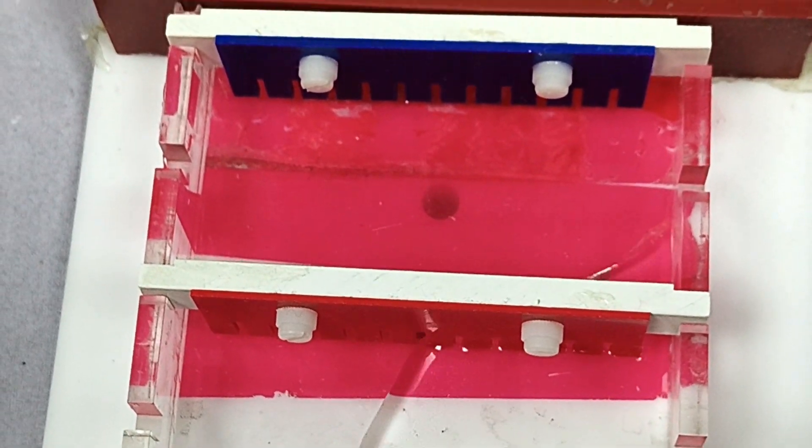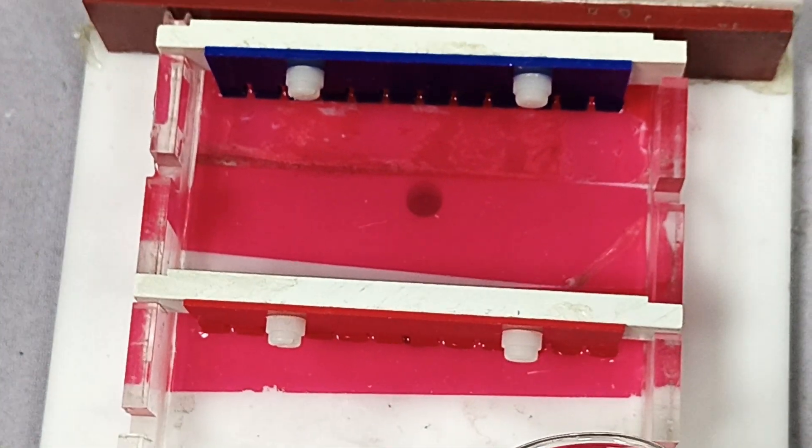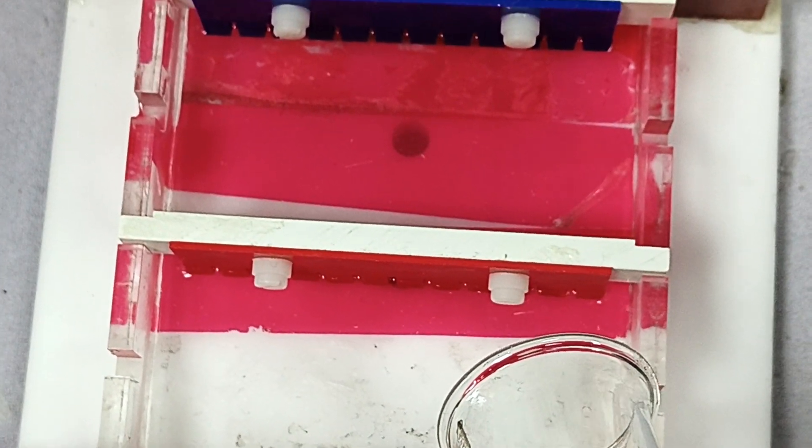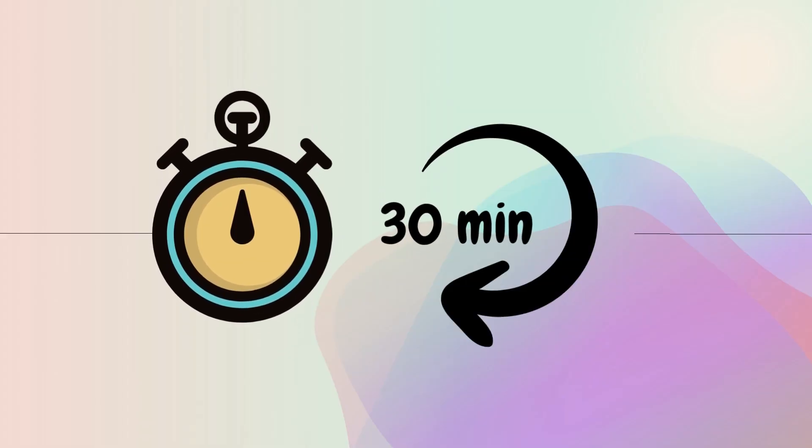Slowly pour this solution to the casting tray so that no bubbles are formed in the gel during the pouring. Even if some bubbles appear, you can pop them using a pipette tip. Let the gel solidify for 30 minutes.